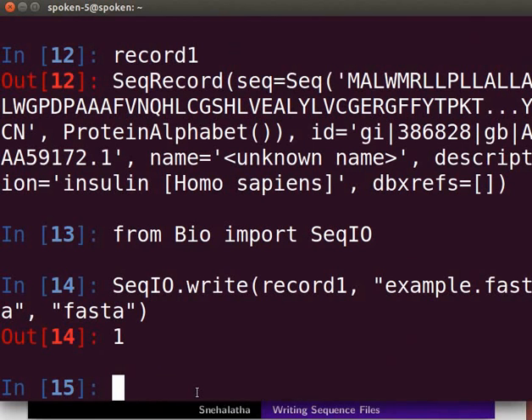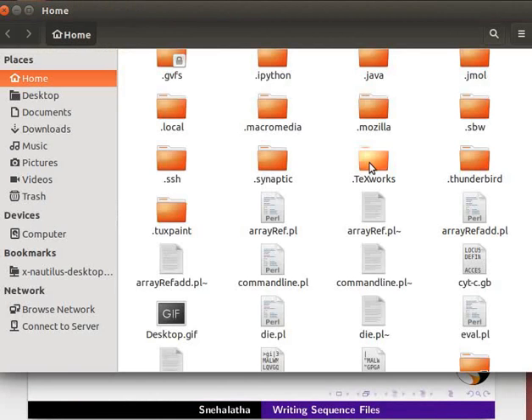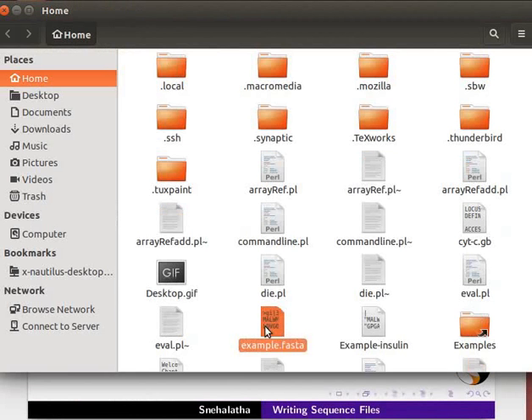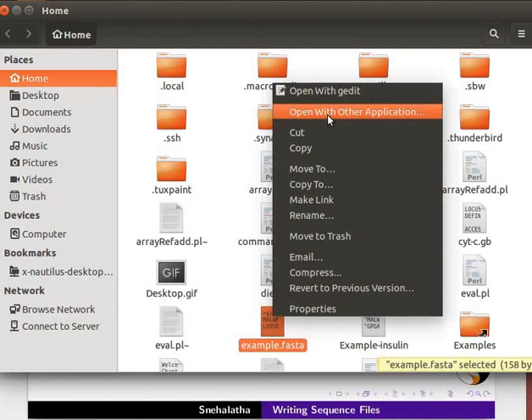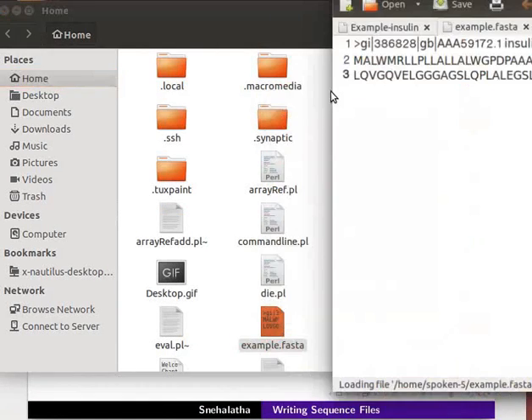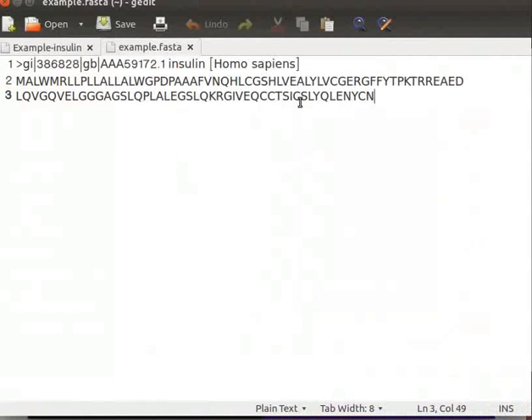Let me warn you, the output will overwrite any pre-existing file of the same name. To view the file, navigate to it in the home folder and open it in a text editor. The protein sequence is now in FASTA format.